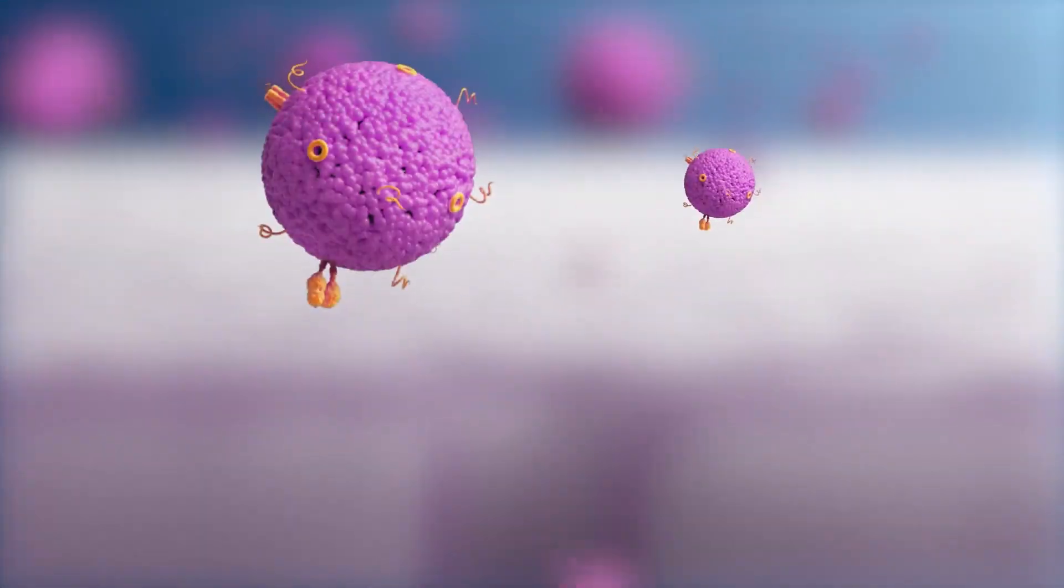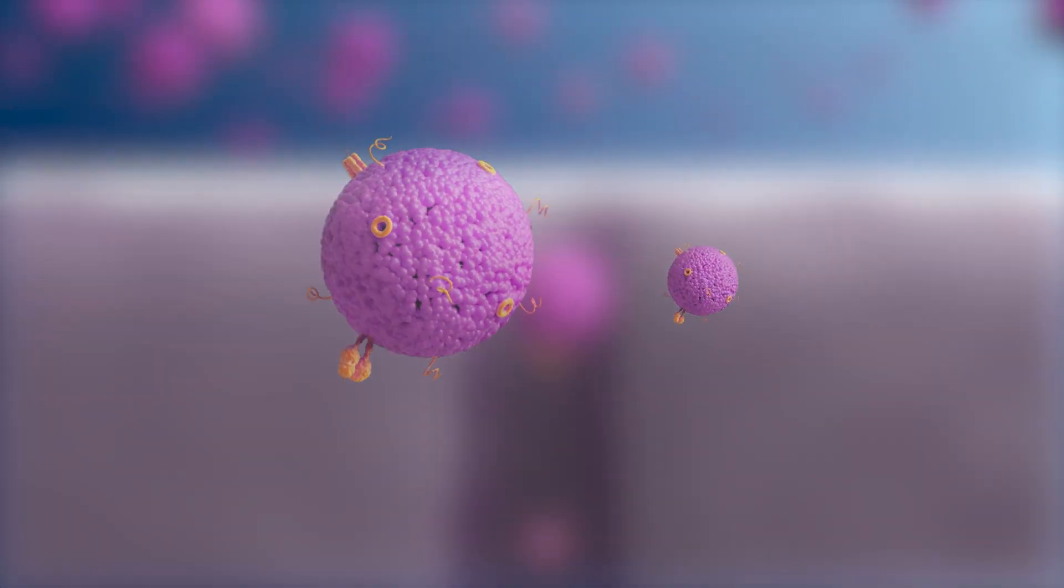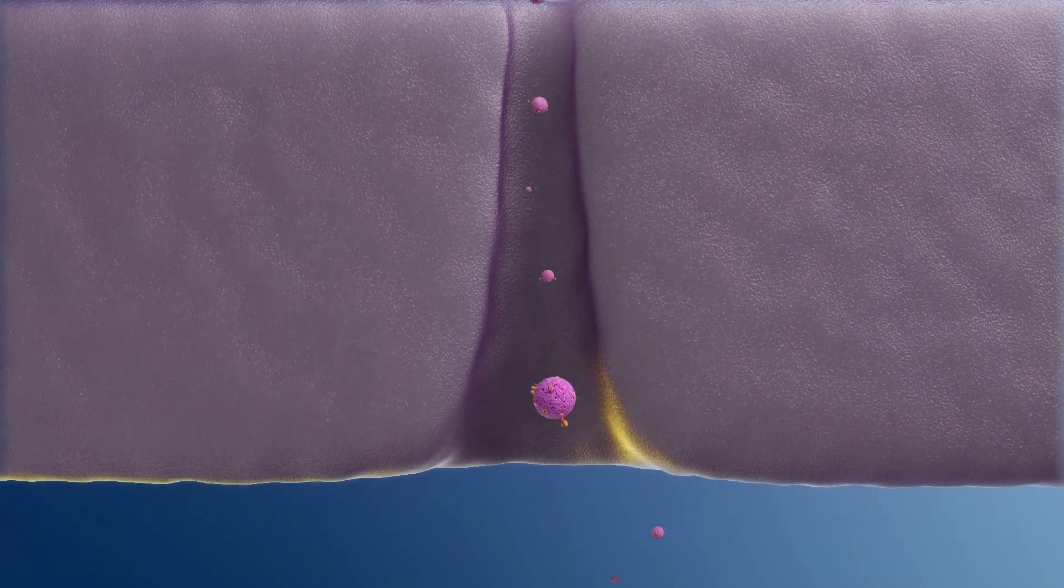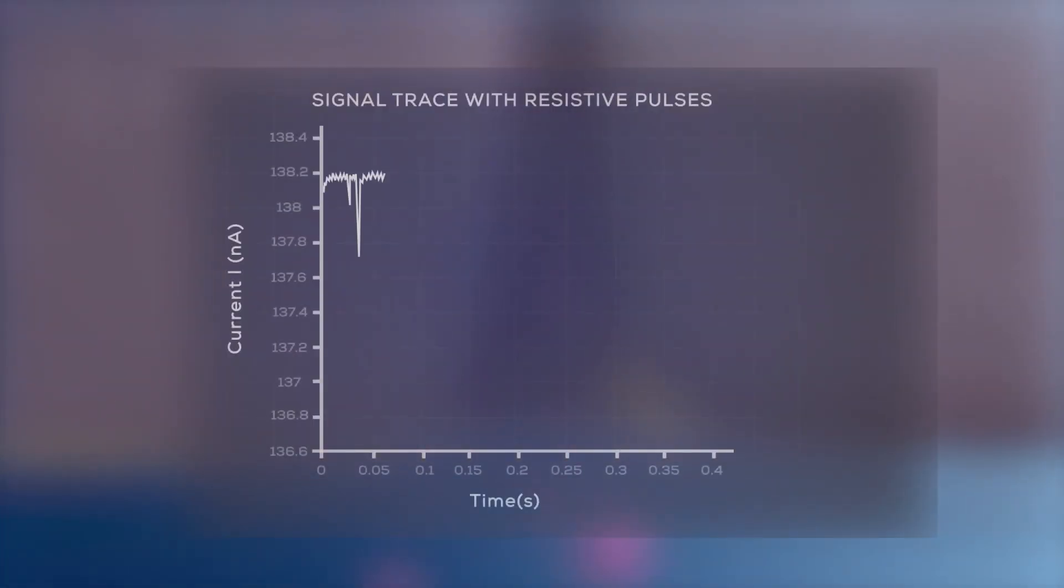TRPS measures particles from 50 nanometers to 20 microns as they pass through a tunable nanopore. When particles cross the pore, they block the flow of current, resulting in a blockade signal.